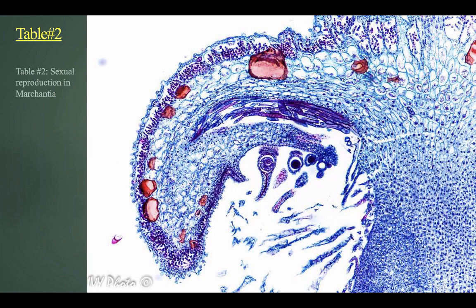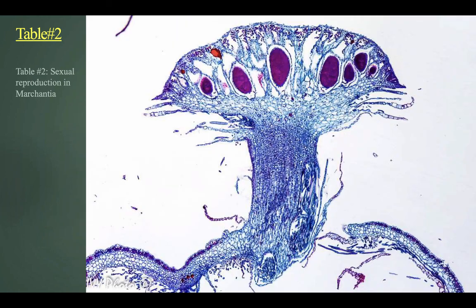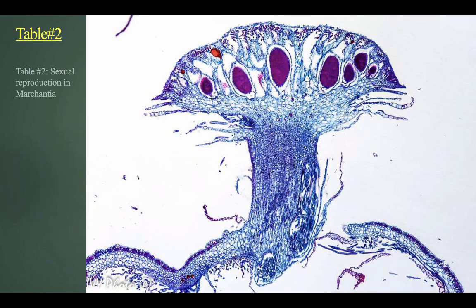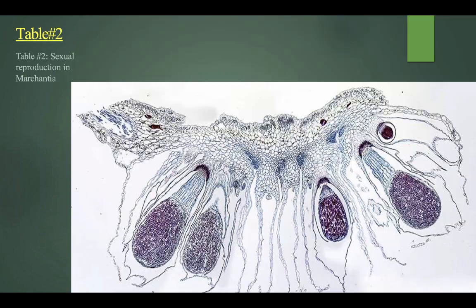Let's find... They're going to ask you about this, and then this one, they're looking at the antheridial head. And so this is male and sperm, right? And so you're going to look and you're going to answer, what does archegonia bear? Are they haploid or diploid? You know, can you go on that archegonia, draw it? You're going to do the same thing for your antheridial. And then you're going to talk about, and you're going to move on.